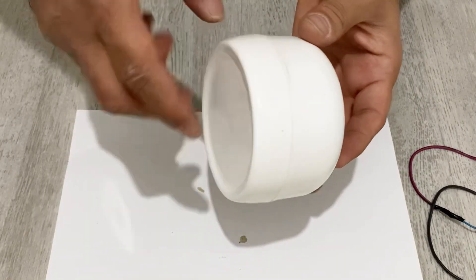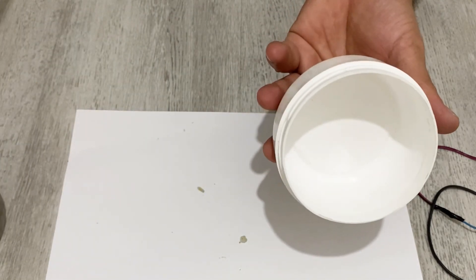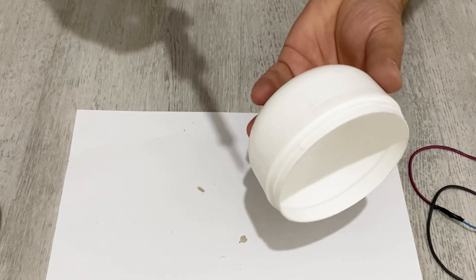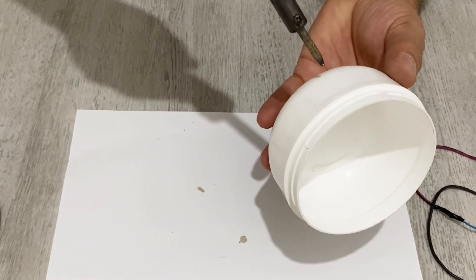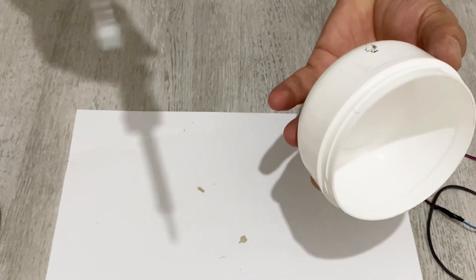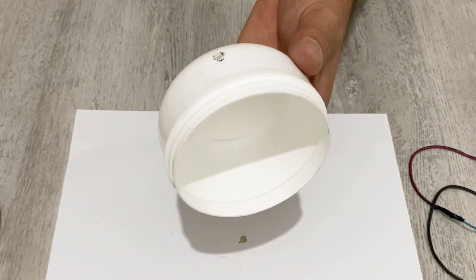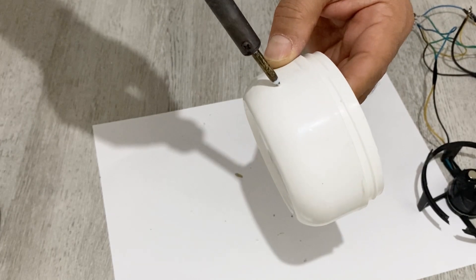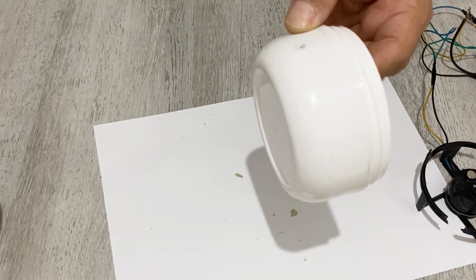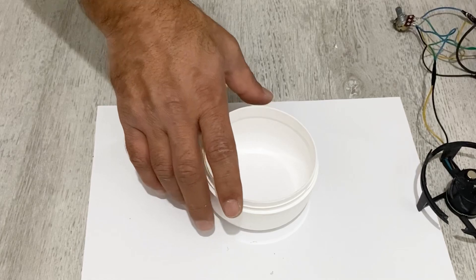Now I'm going to use this plastic box as the case for my magnetic stirrer. I'm going to make a hole here for my potentiometer — just a small hole like this. And I'll also make a small hole here for my input cables.